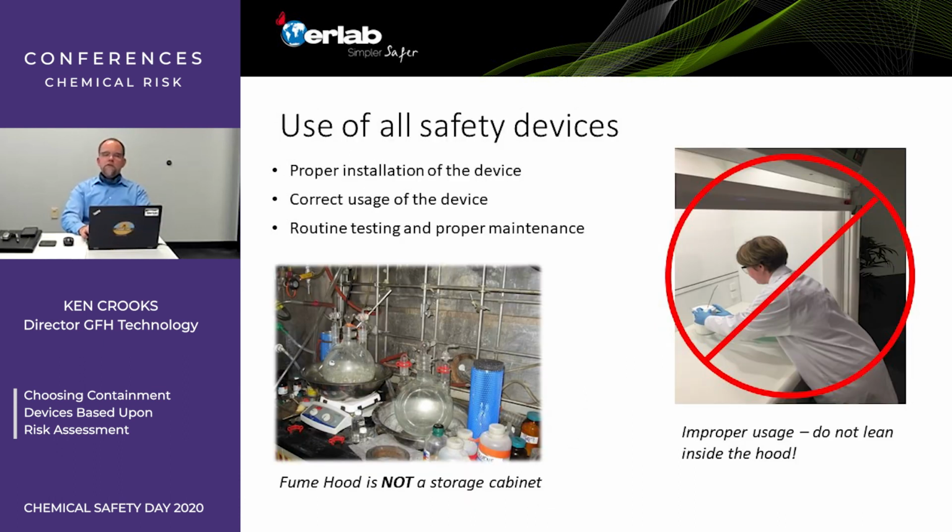So when it comes to the use of any and all safety devices, obviously it has to be done properly, right? So as seen here on the right, Marie is leaning way too far inside of her fume hood. Do not stick your head inside of a fume hood unless it's brand new and has never been used. Otherwise, keep your head, keep your breathing outside of the fume hood, of course. So proper installation, the proper use of the device, and then that's good at the start, but we need to maintain that. So the proper testing annually and the proper maintenance continually of that fume hood.